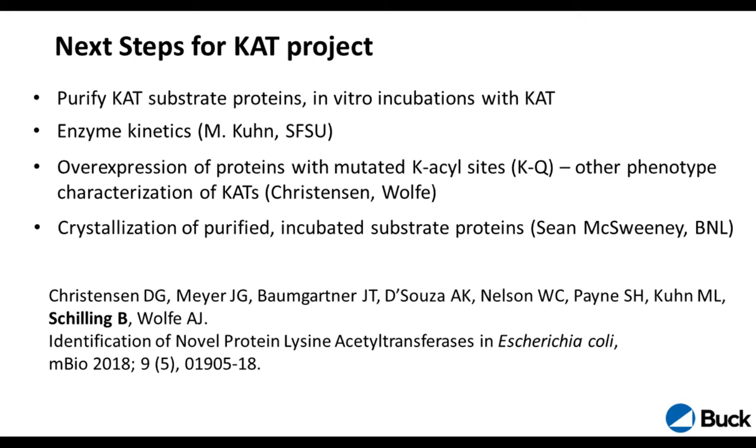So, I hope I could show you in this E. coli project how we used affinity enrichment together with DIA, data-independent acquisition, as a very efficient way to deeply mine the acylome in these bacteria.